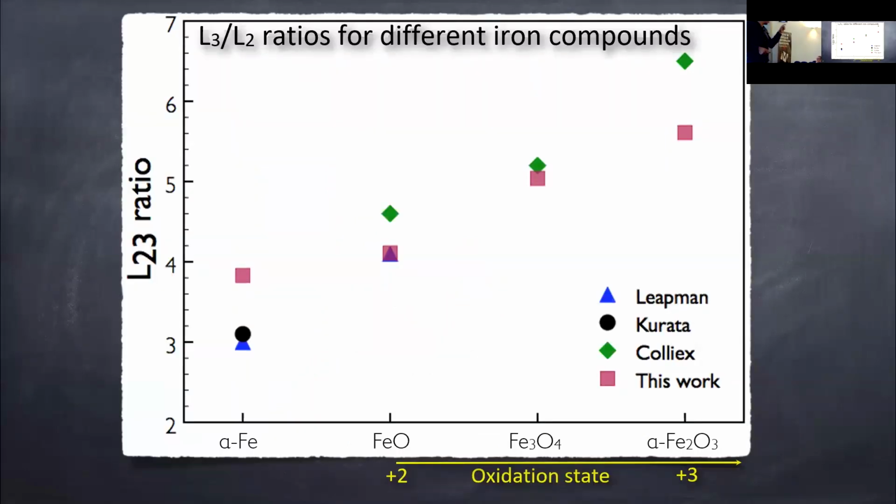You measure the ratios, and you compare, okay, if I have iron oxide, and I'm very bad with these things, so Jaume is always correcting me. Which one is this one? Hematite. And that guy over here? Magnetite. You see, I'm terrible. Well, Fe3O4 and Fe2O3. I'm a physicist, I'm terrible.